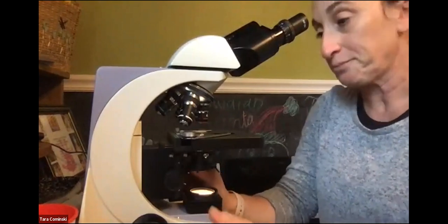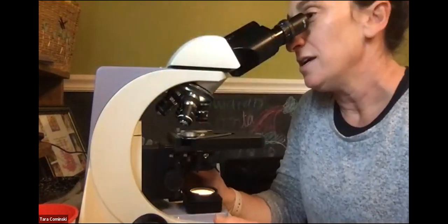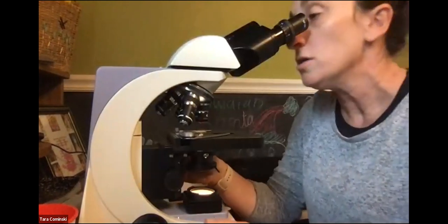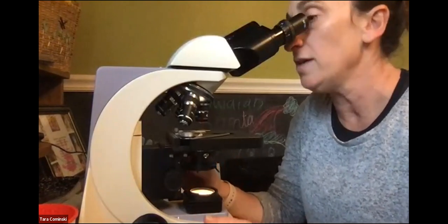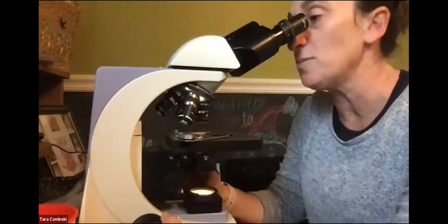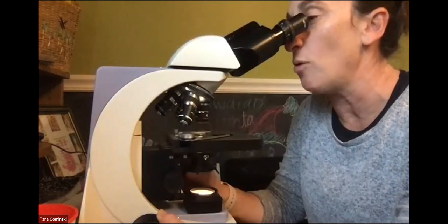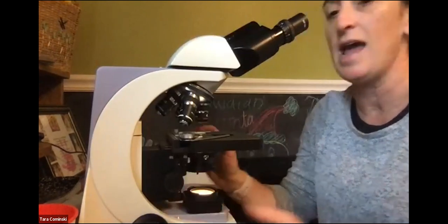Then, with it under scanning, you look in and use the mechanical stage control to get whatever you want to find right in the middle. Then you can use the coarse adjustment to get it into focus. Let me show you it out of focus for a second, and then I'll show you it in focus, okay? So again, I have it under scanning.